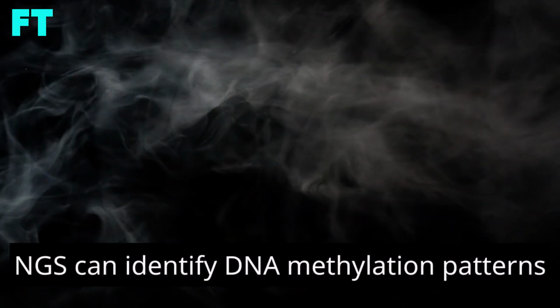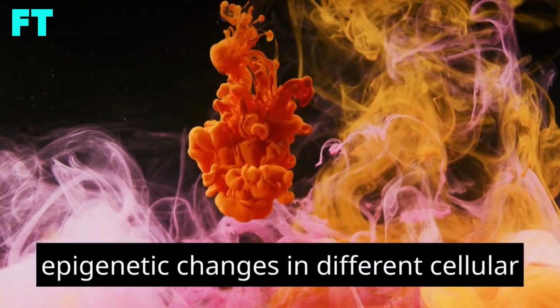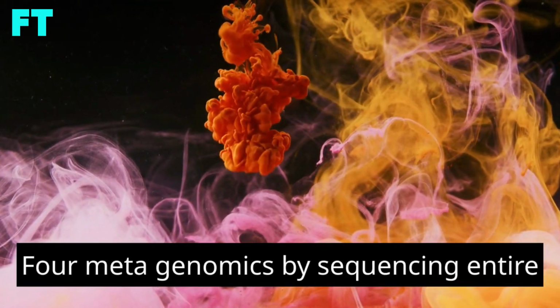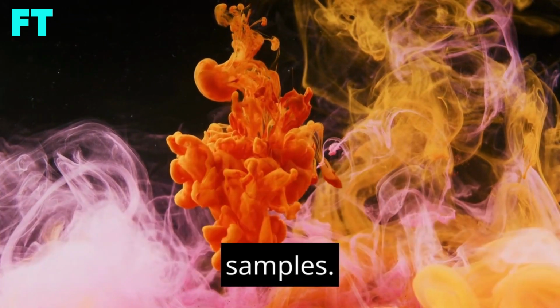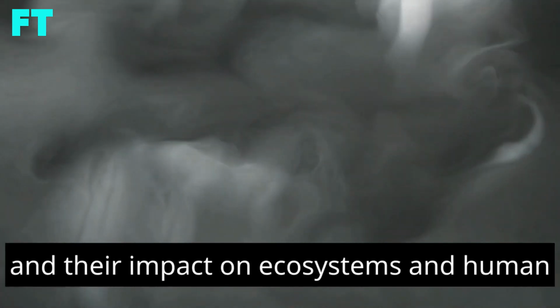3. Epigenomics. NGS can identify DNA methylation patterns and histone modifications, providing insights into gene regulation and epigenetic changes in different cellular contexts. 4. Metagenomics. By sequencing entire microbial communities directly from environmental samples, NGS enables the study of complex microbiomes and their impact on ecosystems and human health.